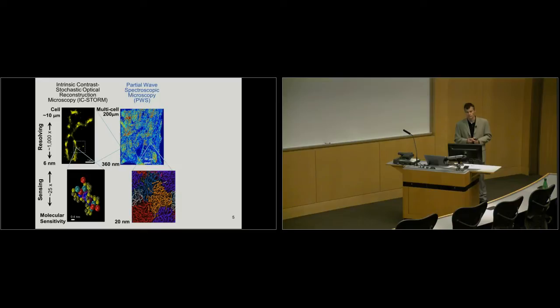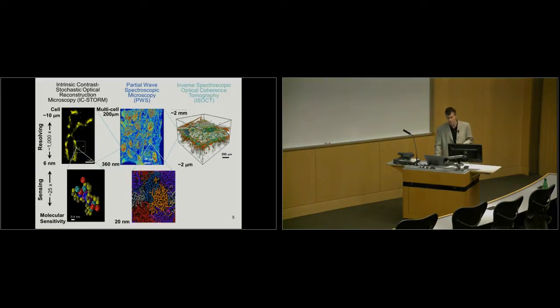As I will explain later today, even if a few nucleosomes move in the cell nucleus, you will be able to sense that, even though the movement itself may be very, very subtle. Let's imagine a nucleosome moves plus or minus 10 nanometers and doesn't go anywhere else. You can sense this kind of motion. So it's very powerful for dynamic, live cell measurement.